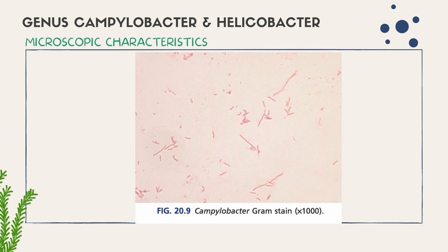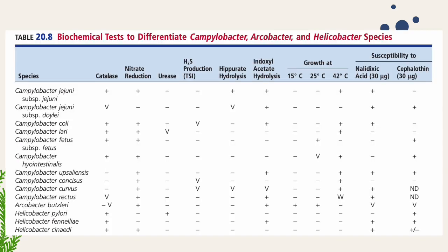So here is the classical seagull wing shape of your Campylobacter species under your gram stain. So saan yung mga seagull wing shape dyan? Ito, mukha silang seagull wing. So ayun, imagination mo kung mukhang seagull nga. Pero for me, mukha namang seagull wing to. Rod na to, or gram-negative rods na to.